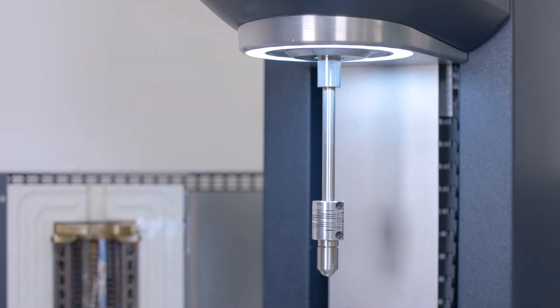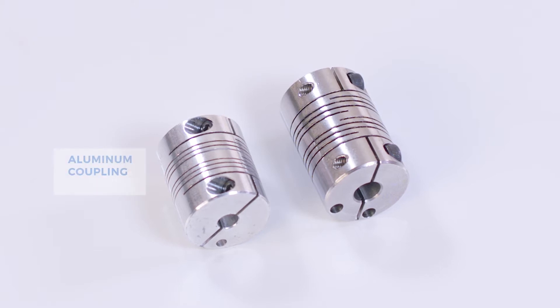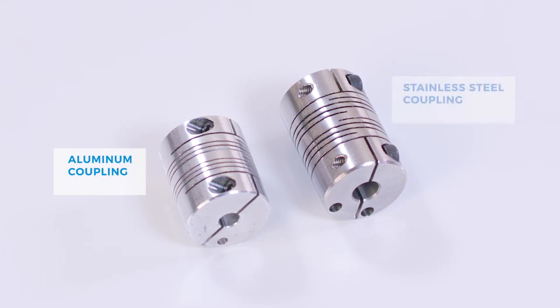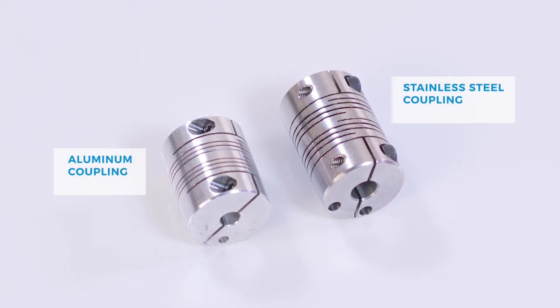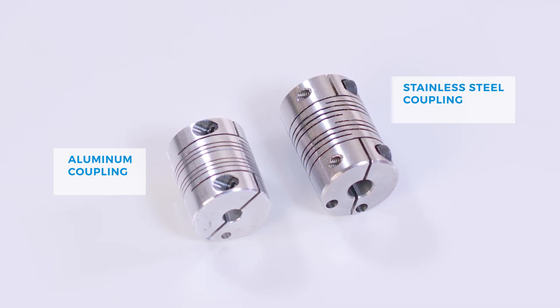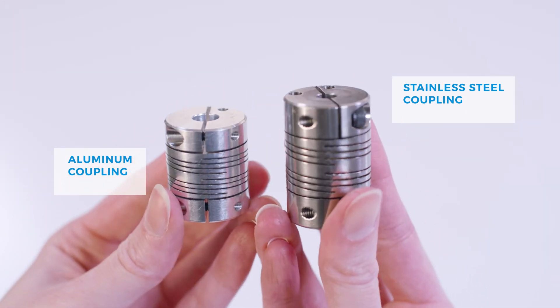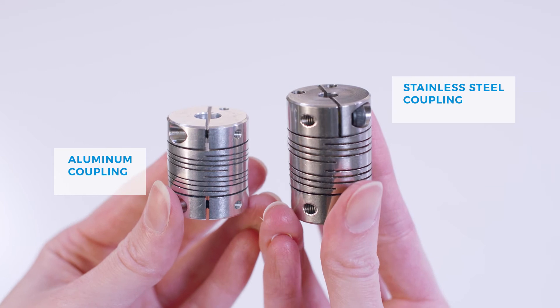In the geometry kit, there are two beam couplings, the aluminum coupling and the stainless steel coupling. These couplings are used to provide excellent alignment between the two surfaces and ensure a uniform distribution of the axial force during the measurement.